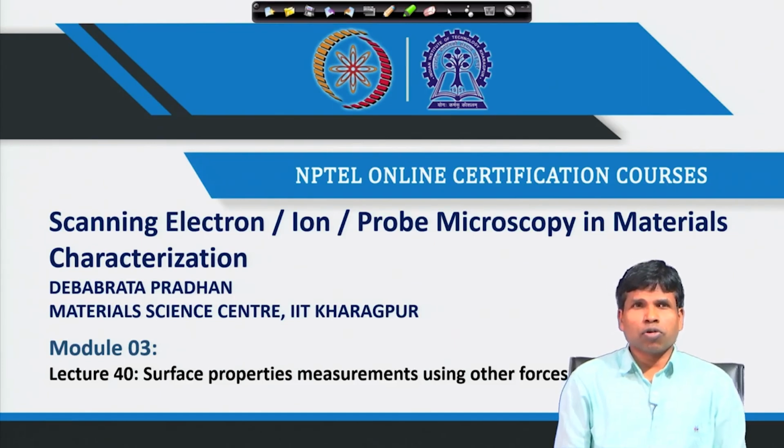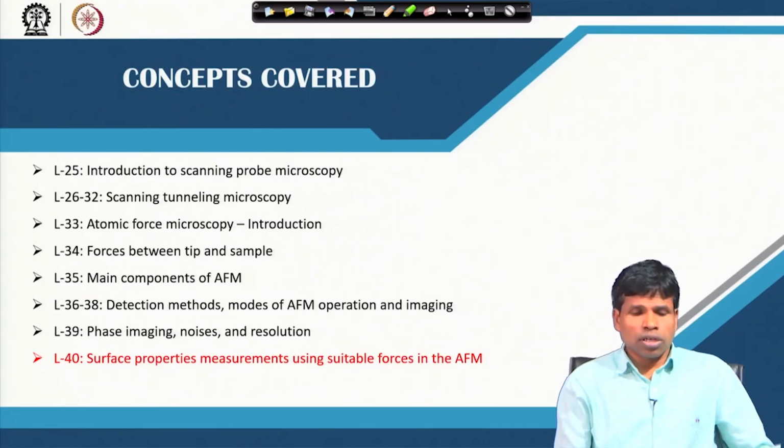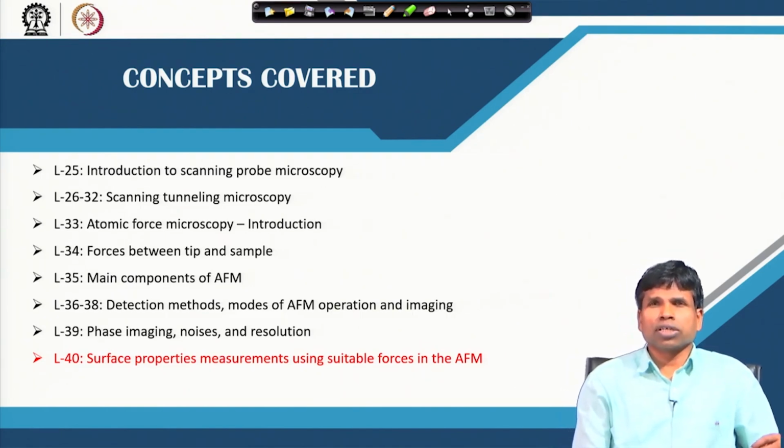Welcome back to our course on scanning electron ion probe microscopy in material characterization. So, now we have been discussing the atomic force microscope. We have discussed different modes of operation and also resolution, artifacts, noises. All this we have discussed, particularly the resolution of the atomic force microscope.